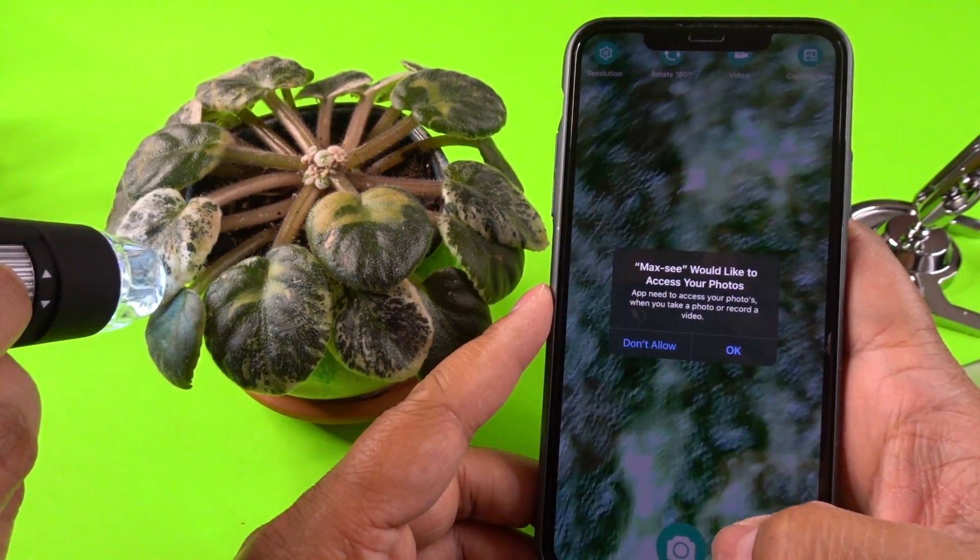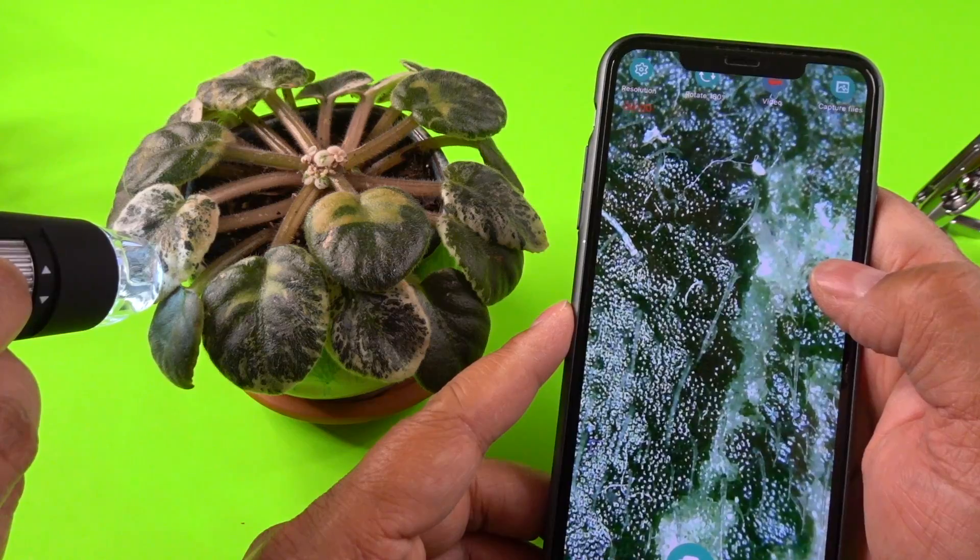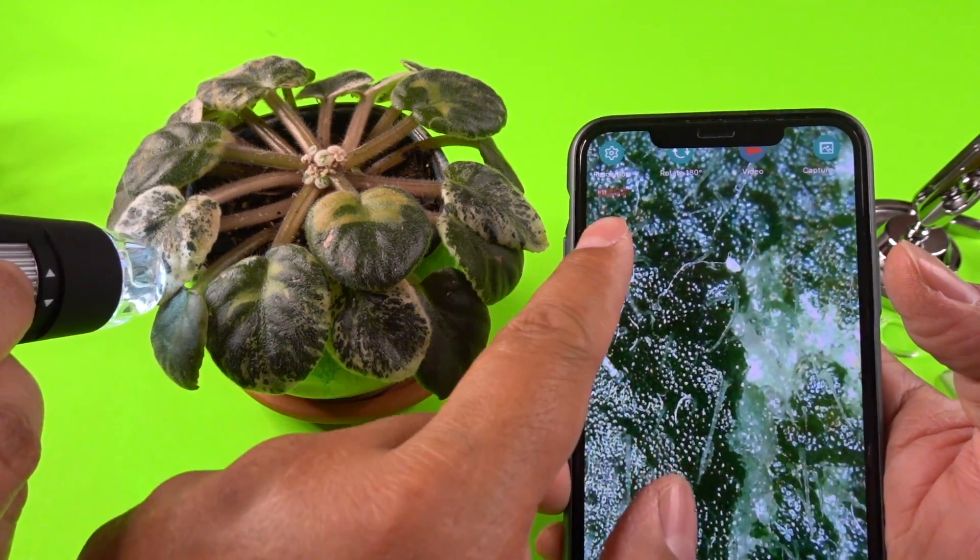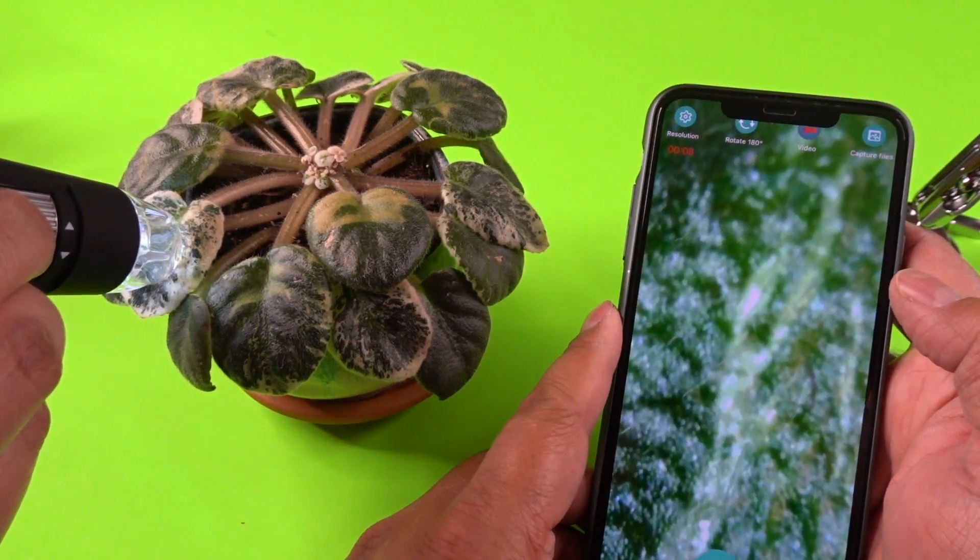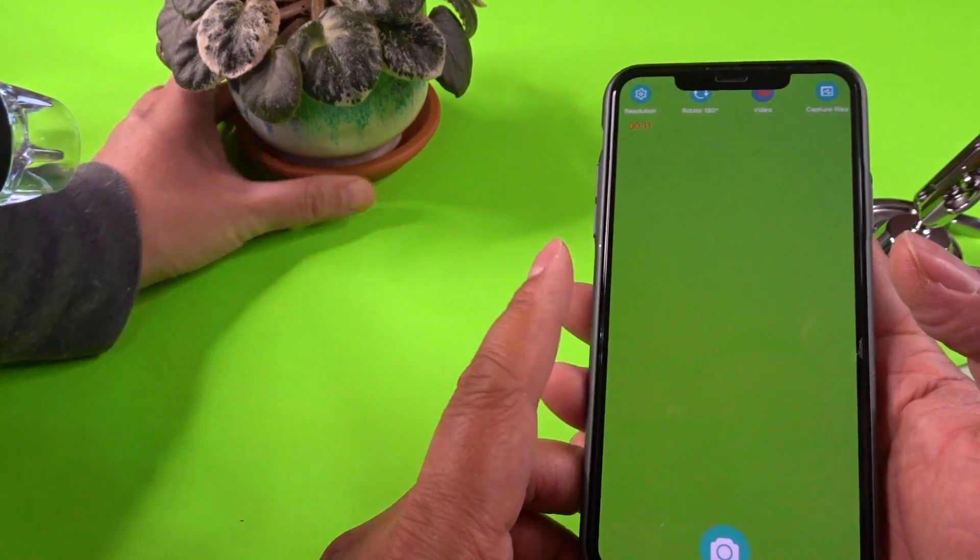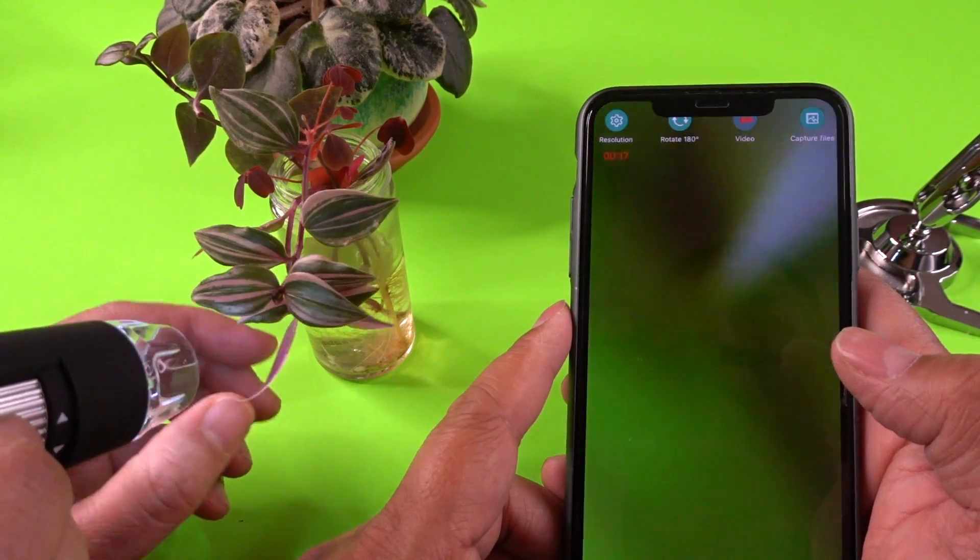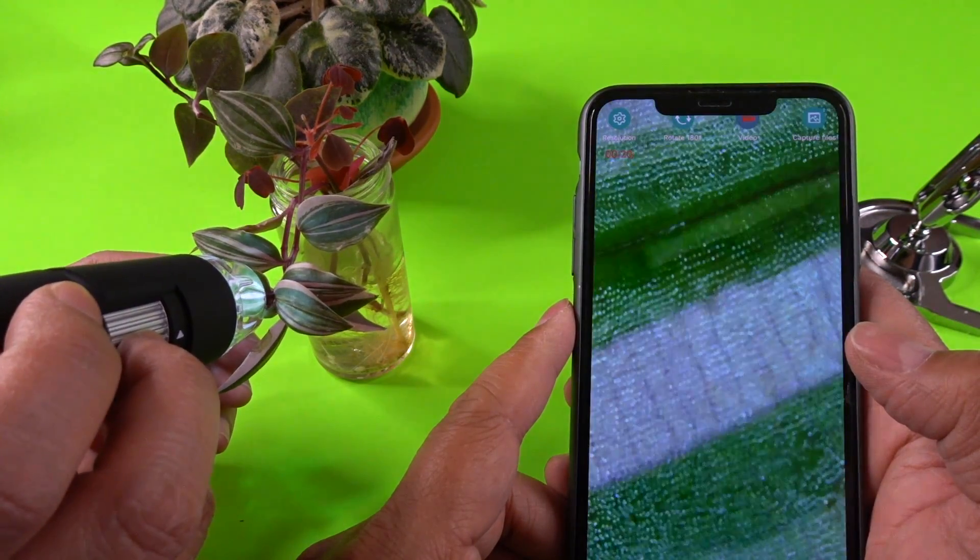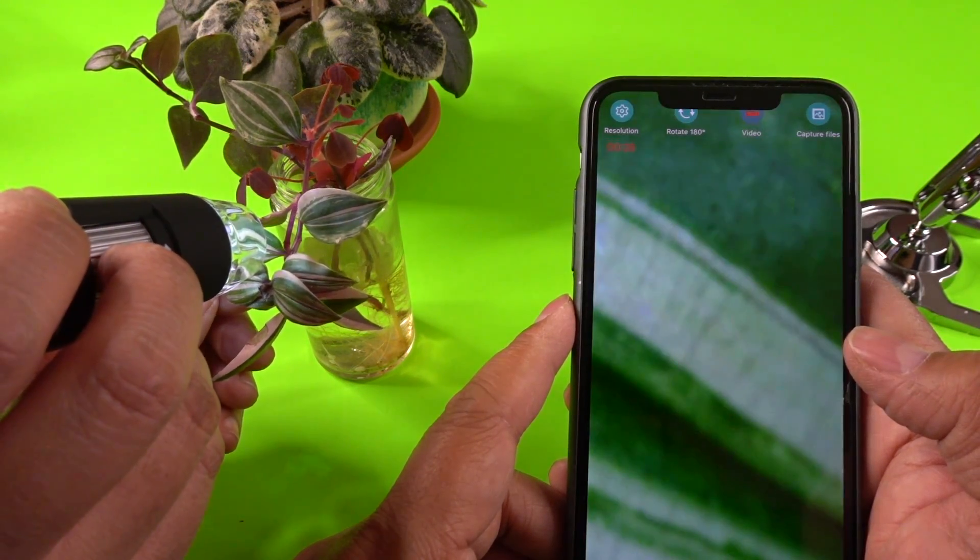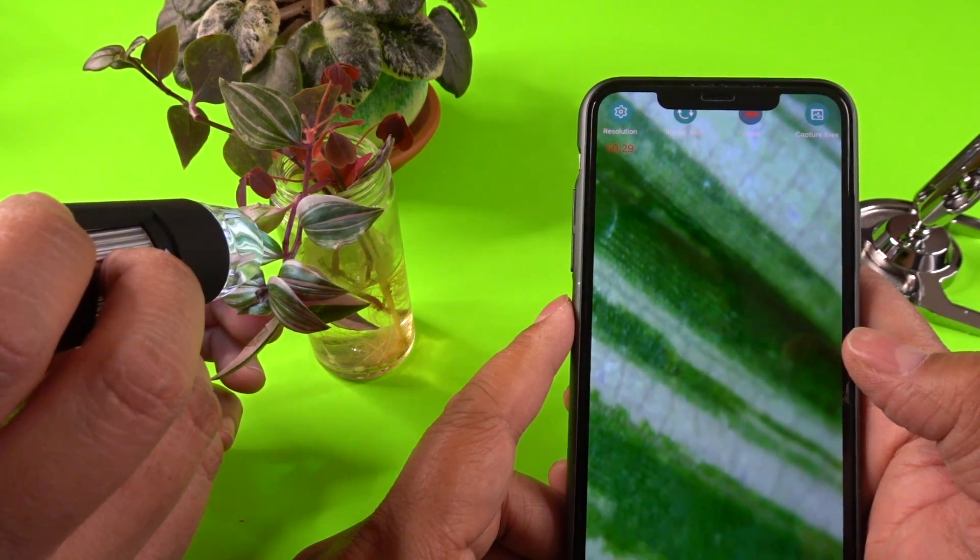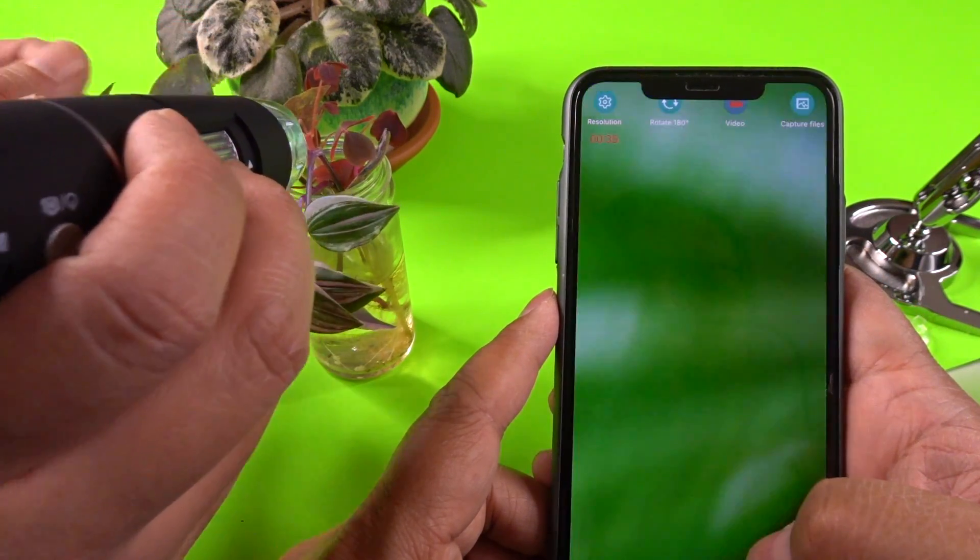And let's see how do we take... So I think I just took a picture. If I go to video it's starting to record you can tell that it's red and there's a timer right there. So that you know it's recording capturing video right now. And it does look like as I move around I may have to refocus. So here's another plant. And look at the detail of that. You can see the very fine textures of this leaf. Something that you'd never think about at a microscopic level. Until you really look at it like this.